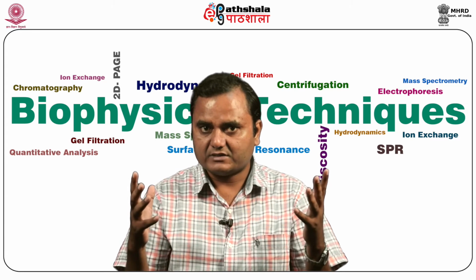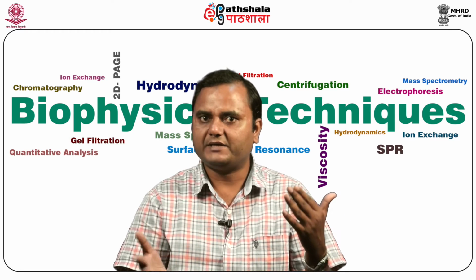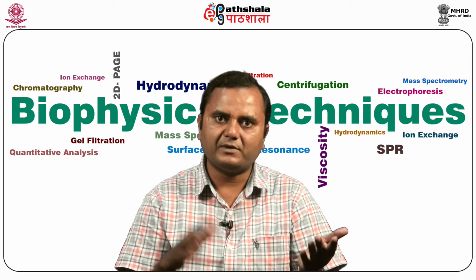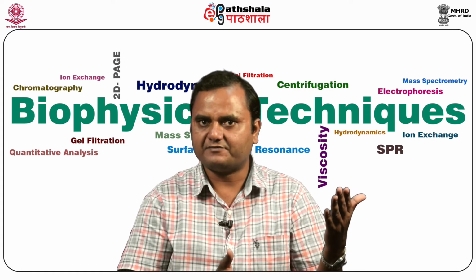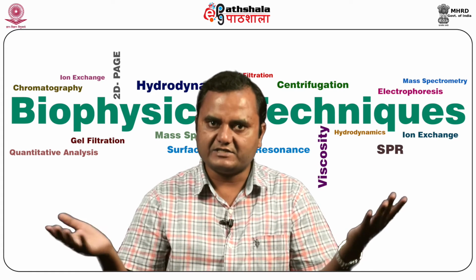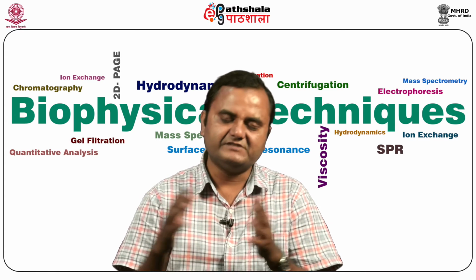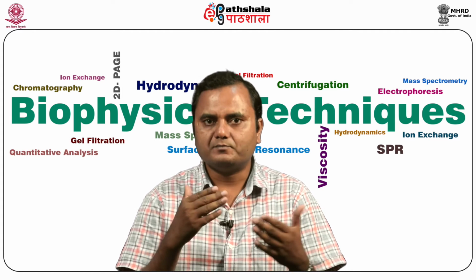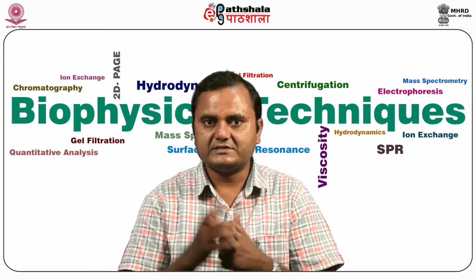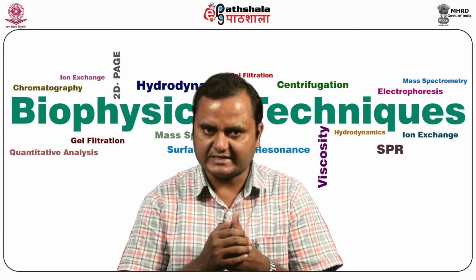So if you talk about its components, the analytical centrifuge is actually the preparative ultracentrifuge coupled with the optical system. It is simply a preparative ultracentrifuge that rotates at a very high speed, and it is coupled with the optical detection system which gives you the dynamic picture of the molecules inside the sample, that is used to measure the sample concentration inside the centrifuge during or after the sedimentation process.